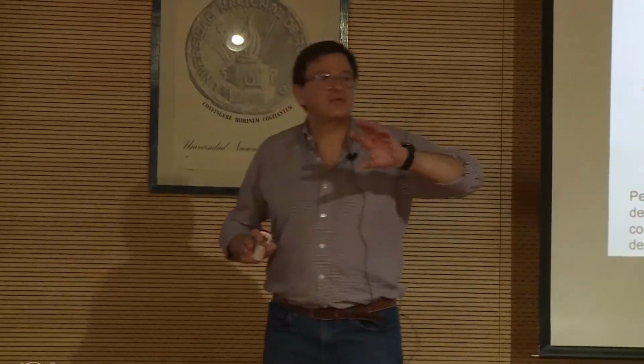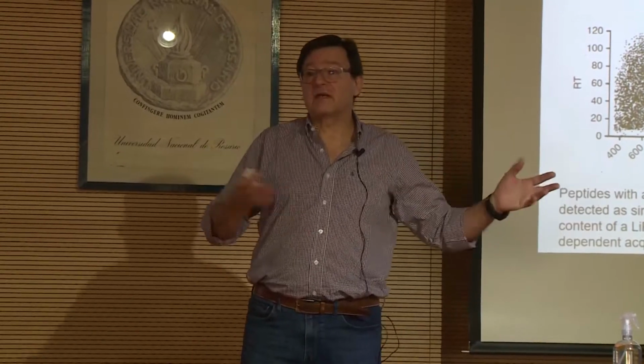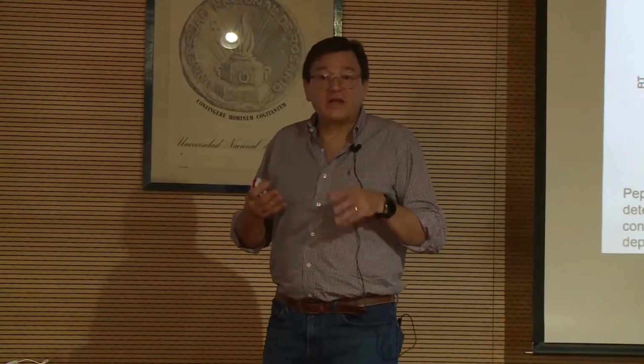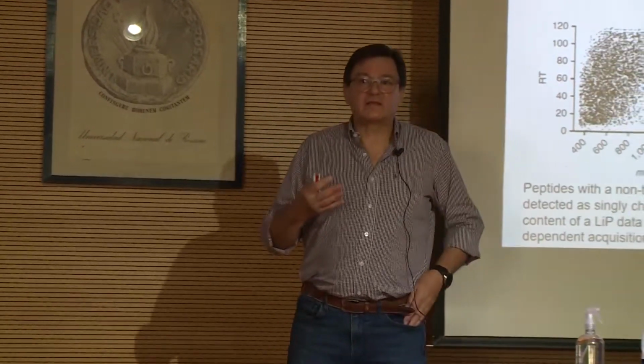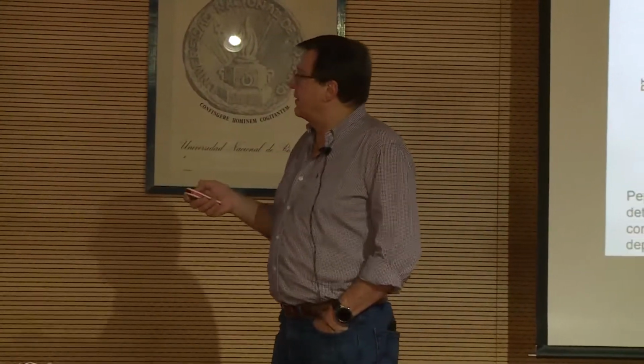It's not a sample that you just send and say identify, because he will give you the tryptic peptides but will miss the peptides that are not tryptic, or maybe he doesn't care about these peptides.